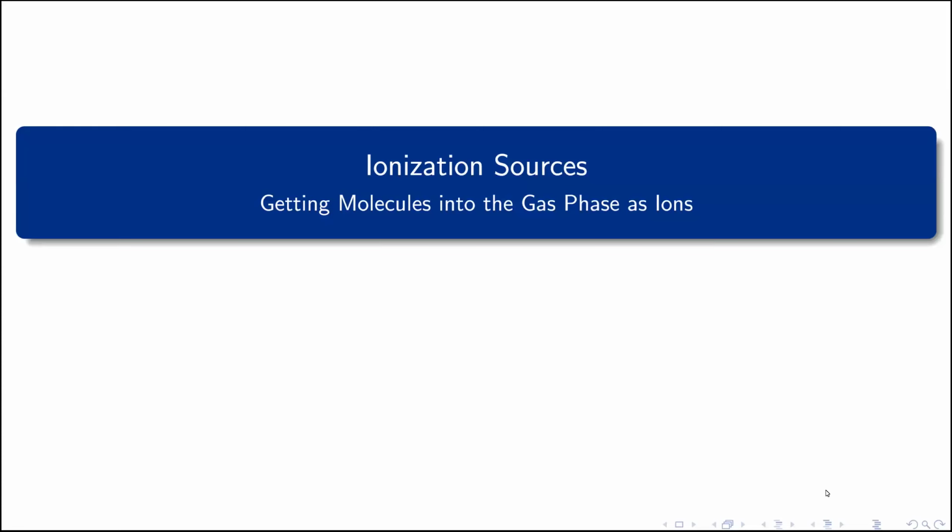Welcome back. In the previous lecture, we built a conceptual framework for mass spectrometry: the five-module architecture, the vacuum requirement, and the five key performance metrics. We touched briefly on the ion source and called it Module 2, but we left the details for today. This lecture is entirely about Module 2, the ion source. Every mass spectrometry experiment lives or dies by how well this one component performs. Let's begin.